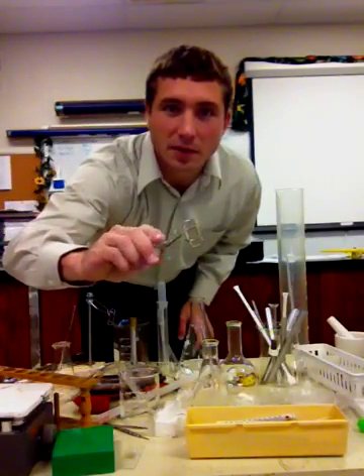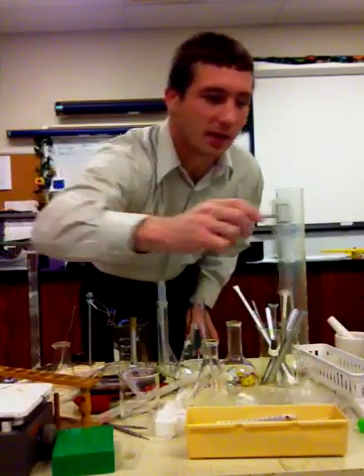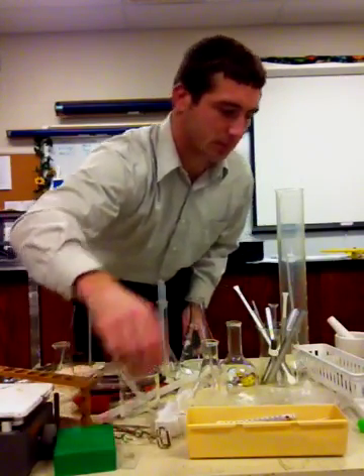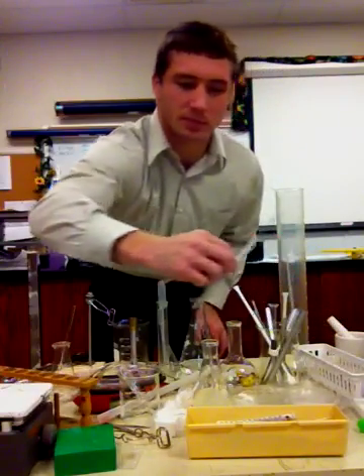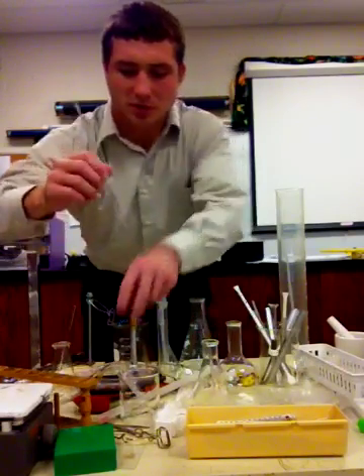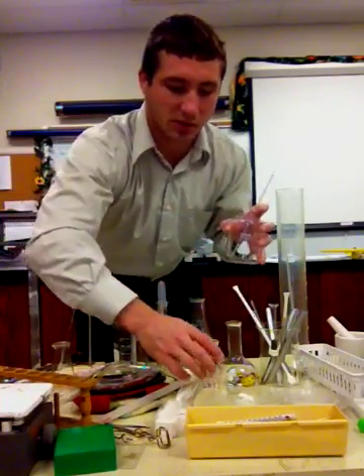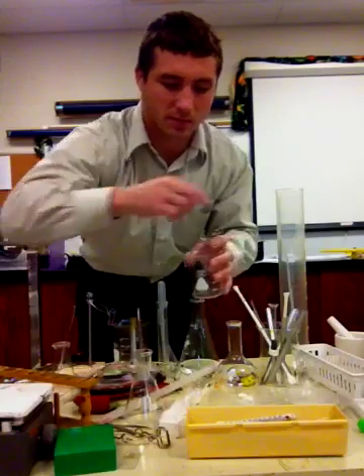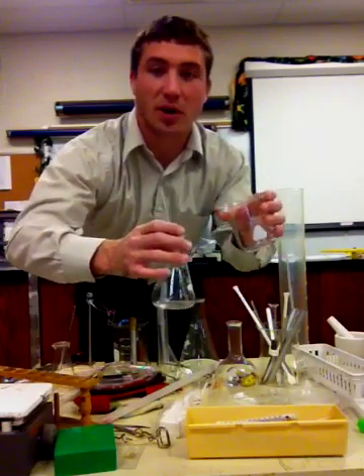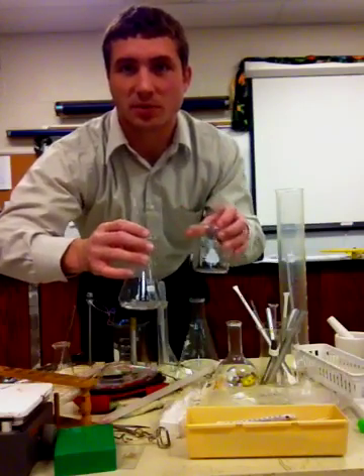This tiny little thing is actually a test tube holder — we can pick up a test tube simply like that. This tiny little glass rod is known as a stirring rod. We usually use this to help pour some type of liquid or guide a liquid into another container, such as pouring from a beaker into an Erlenmeyer flask down the rod.